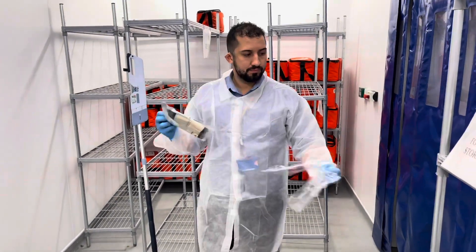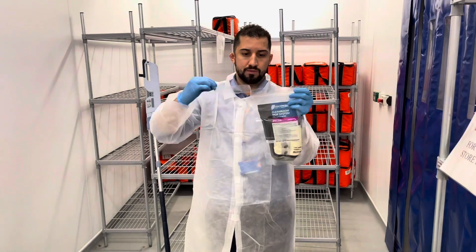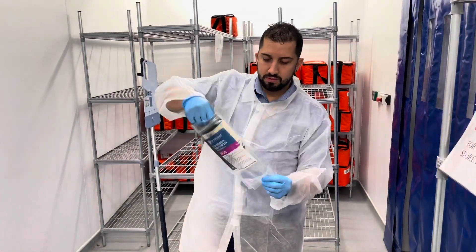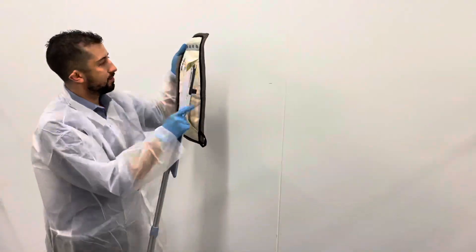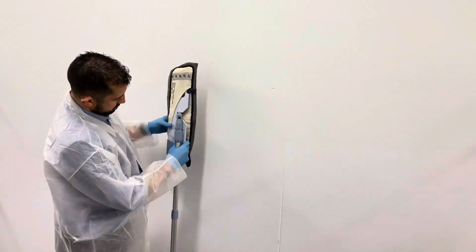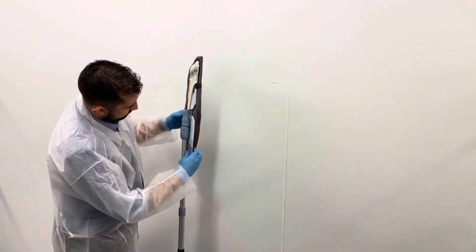Open the sealed package for the micro clean mop and attach it to the mop handle. Make sure it is in securely as the fitting can be quite tight.